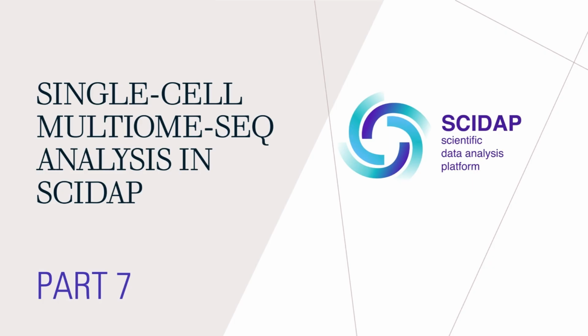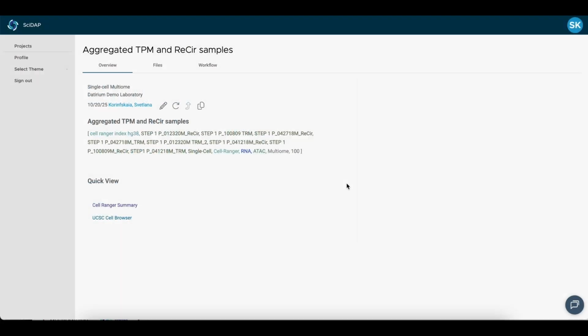In the previous video, we started the Cell Ranger Aggregate pipeline to assemble all our samples into one big dataset, and now we will see the initial result before moving to the filtering steps. The output of this pipeline consists of the Cell Ranger summary and the link to the UCSC browser.